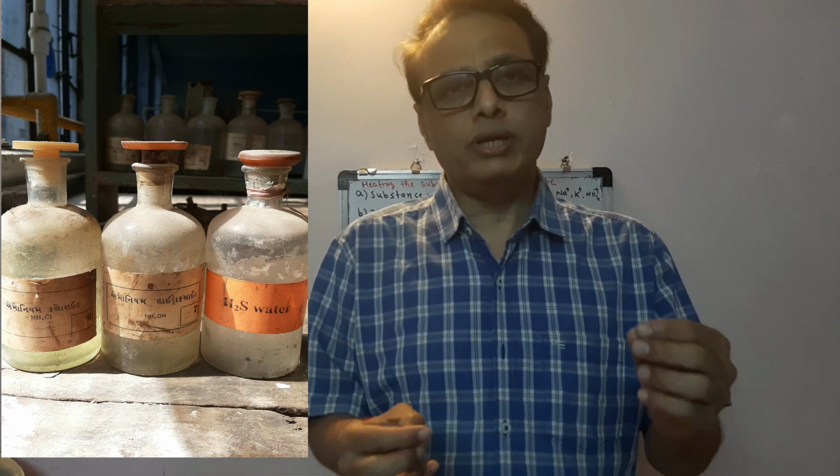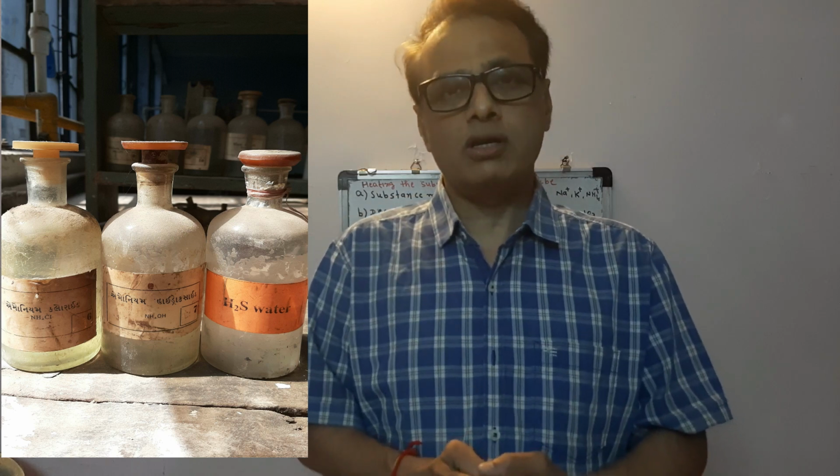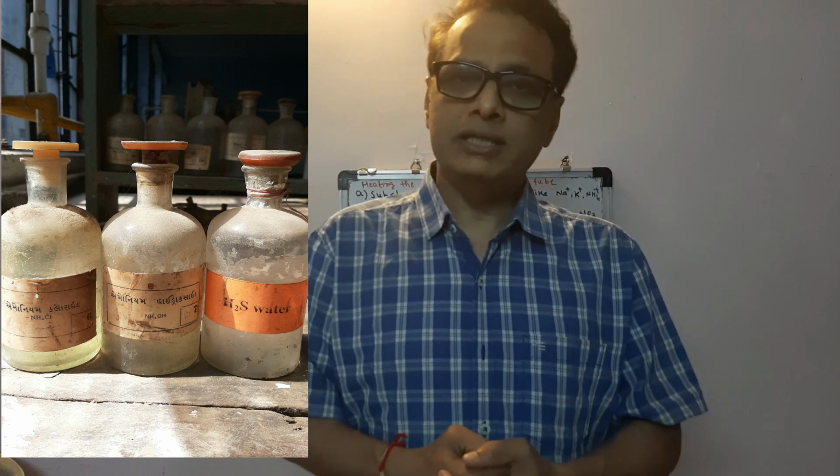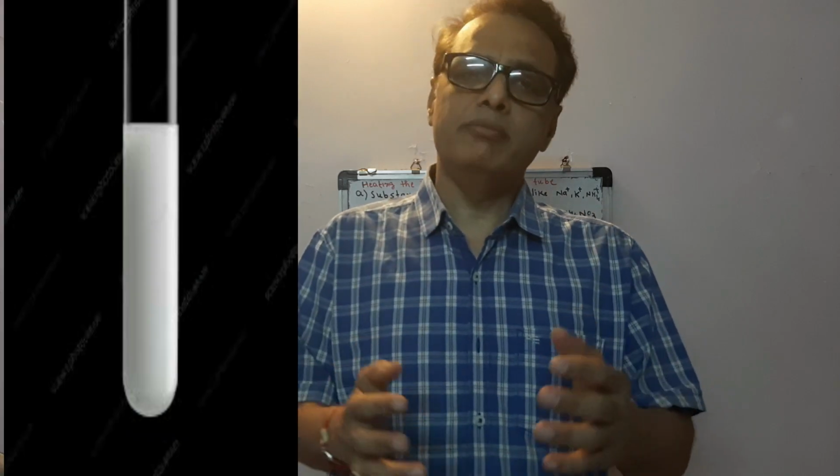So we take original solution, NH4Cl, NH4OH and H2S water, and if you get precipitates, then third B group is present. Here we get precipitates as sulfide. Therefore nickel, cobalt, zinc and manganese are included in third B group.